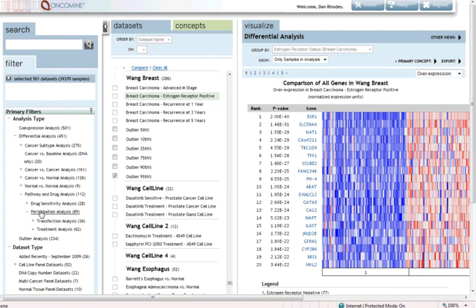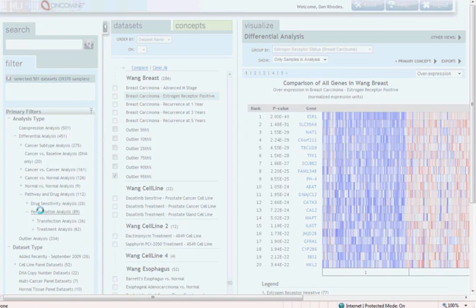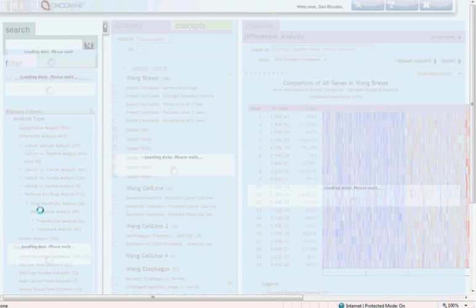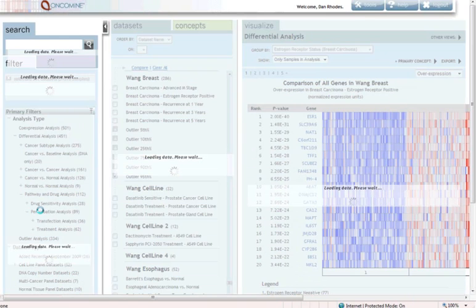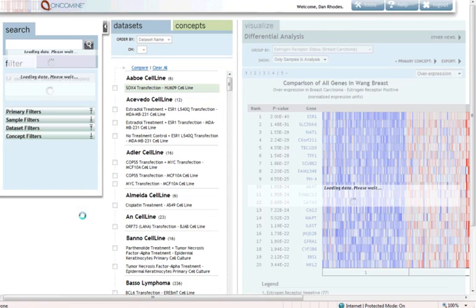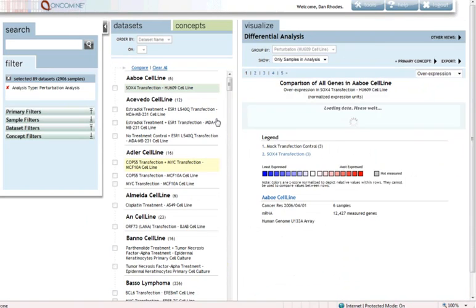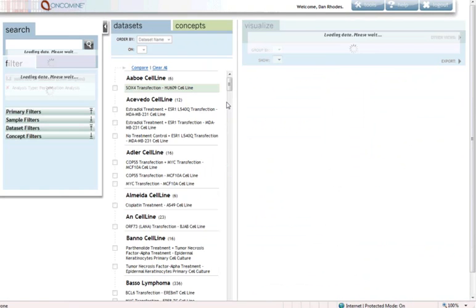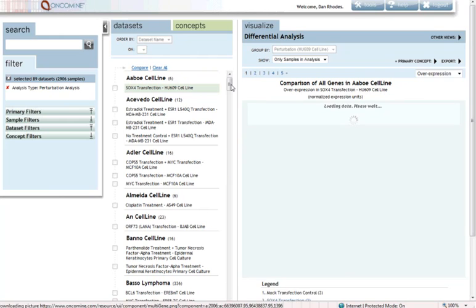Perturbation analyses are gene expression analyses in which a particular gene is perturbed, either by transfection or by RNAi knockdown. By clicking on perturbation analysis, I'm going to see the 89 analyses in Oncomine that look at perturbations, and we're going to select one of them for a gene signature analysis.